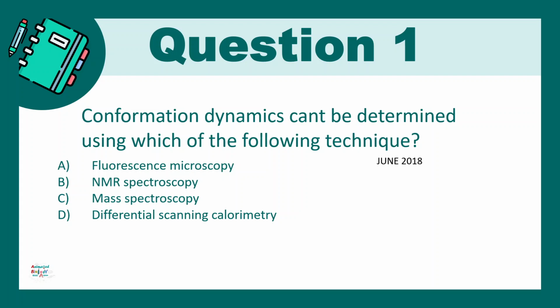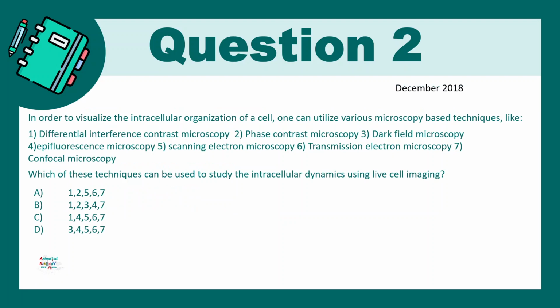If you have answered correctly, the correct answer is fluorescence microscopy. Fluorescence microscopy can highlight intracellular structures, cellular dynamics, or organelle dynamics. It cannot show us about molecular dynamics in details. Question number 2 is from December 2018.